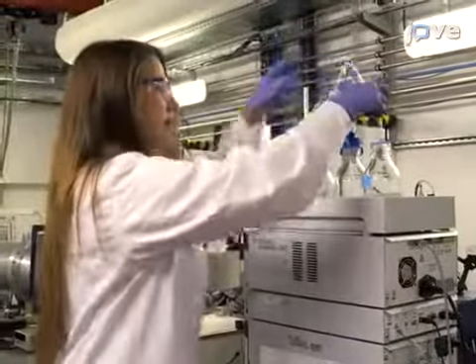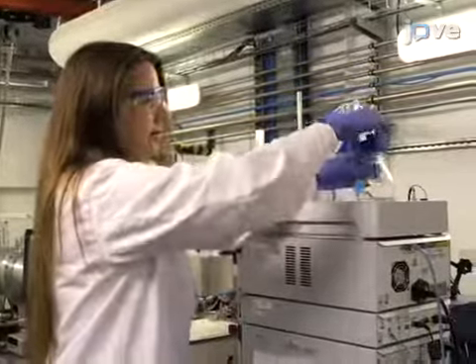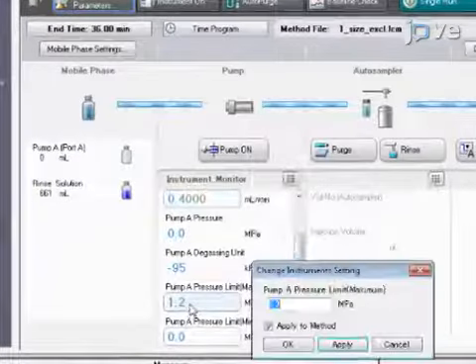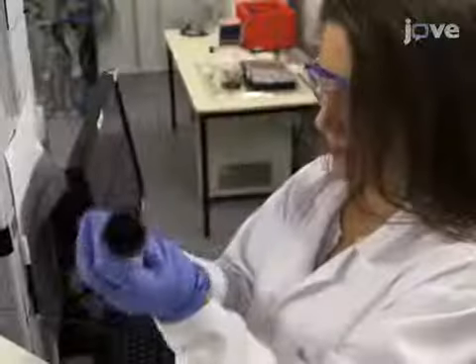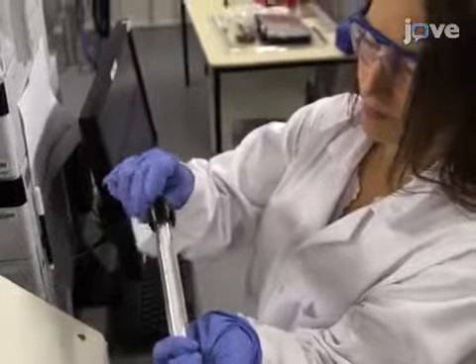Then, connect a bottle of gel filtration buffer to an HPLC system in line with the flow-through capillary of the SAXS setup. Set the flow rate, maximum column pressure, and acquisition time. Note the back pressure without the column. Purge the lines and then connect and equilibrate the size-exclusion chromatography column.